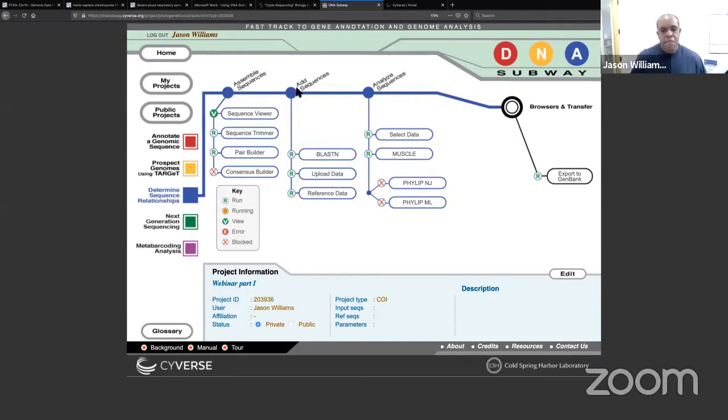Then the next time we come back, we'll go a little bit deeper into some of the science behind DNA barcoding, and we'll also learn about this tool called BLAST, which allows us to say, well, here's my sequence, and if I want to compare another sequence, has anybody ever found or described something that looks like what I found or described? And then finally, we'll also show you some other tools in part 3 to actually draw some comparisons between different species using phylogenetics.